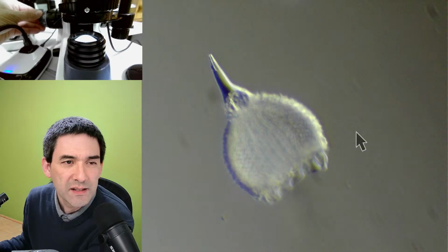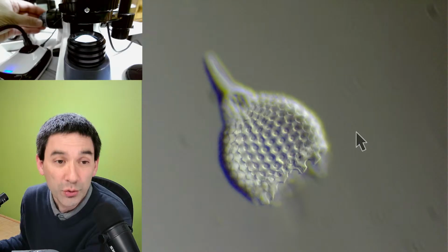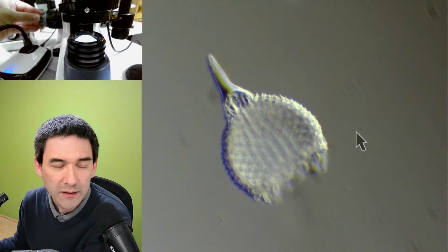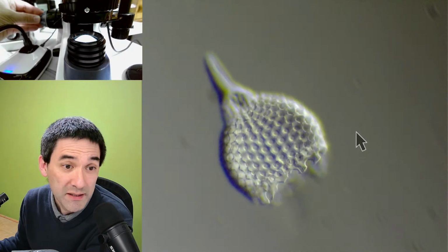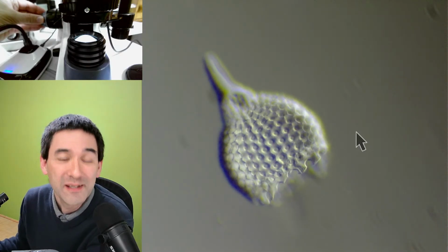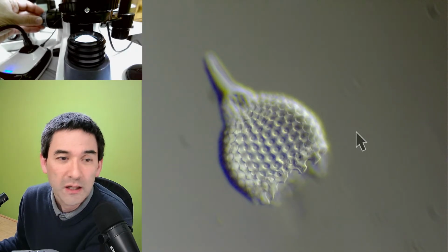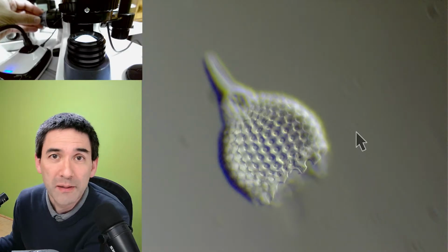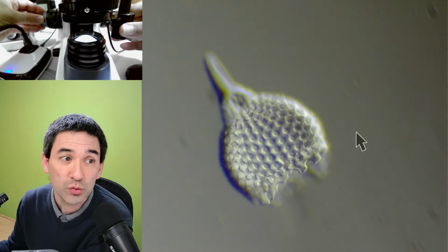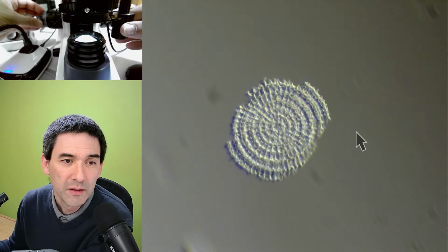The effect is somewhat similar to so-called DIC, differential interference contrast. The mechanism is quite different, but it's similar, with one huge difference: you're getting a similar result with practically no additional cost. DIC is horribly expensive because the optics are so expensive, but oblique illumination like we're doing here is really cheap. You just need the filter.